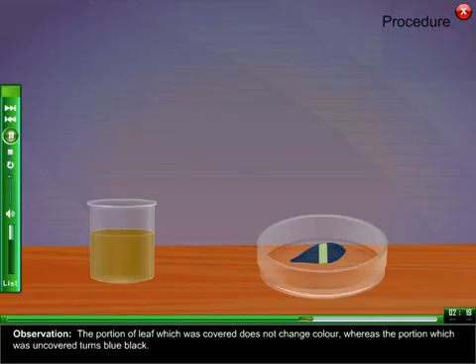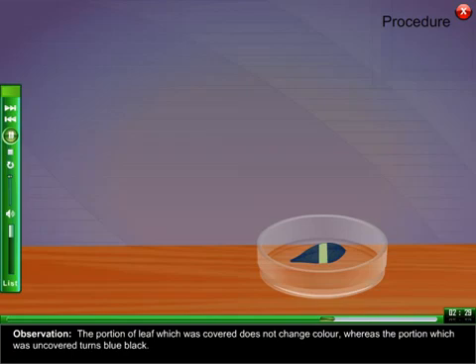Observation: The portion of leaf which was covered does not change color, whereas the portion which was uncovered turns blue-black.